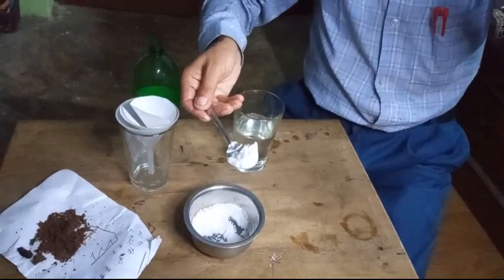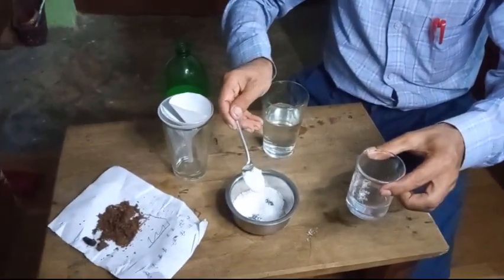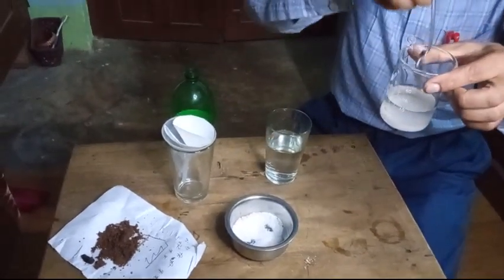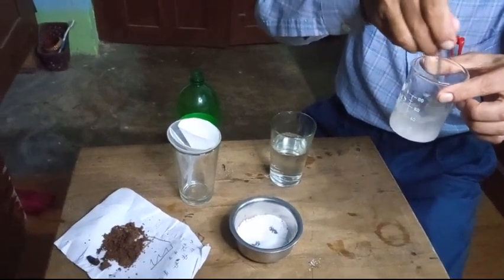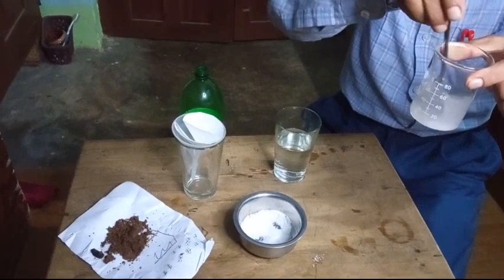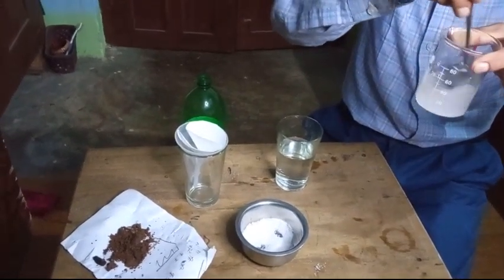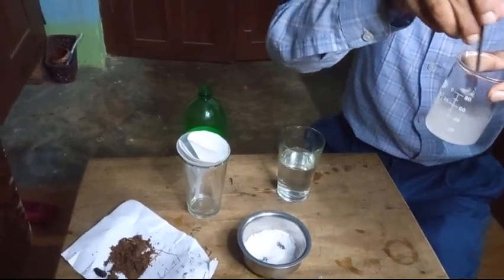Take some water in a glass beaker. Add salt and stir it very slowly, a little bit slowly and slowly. First of all, it becomes an unsaturated solution.